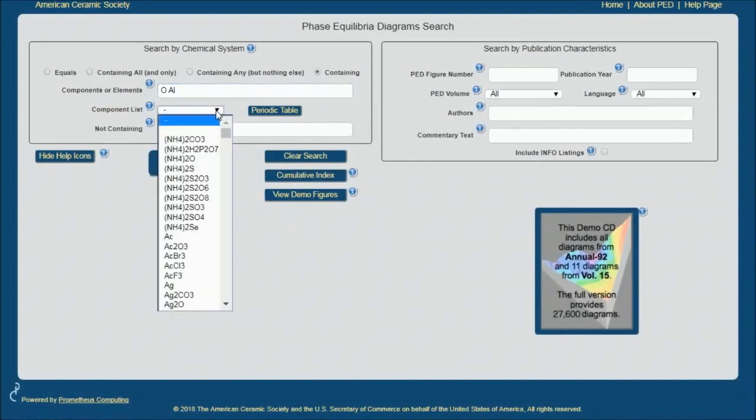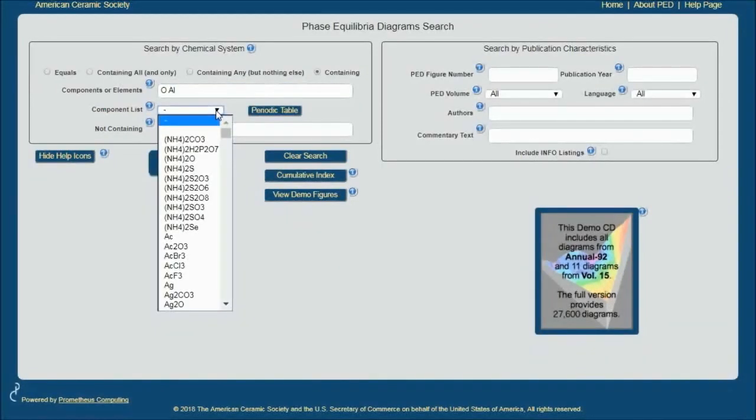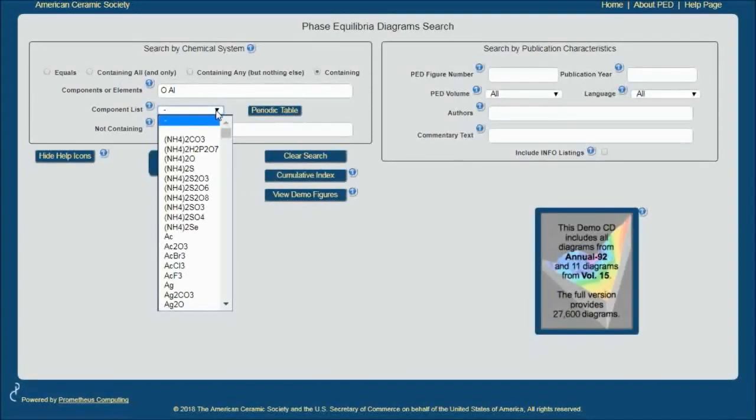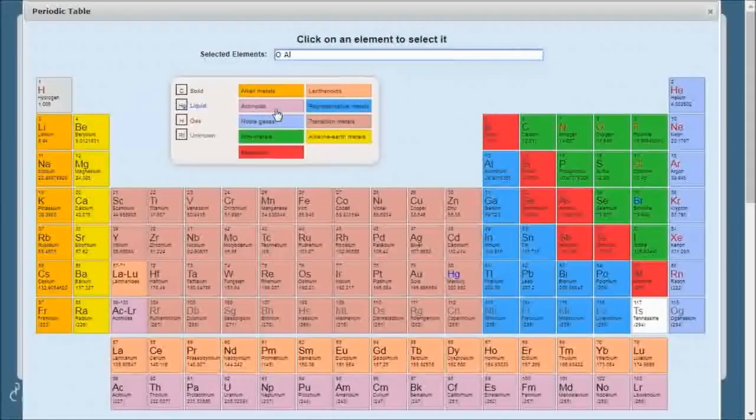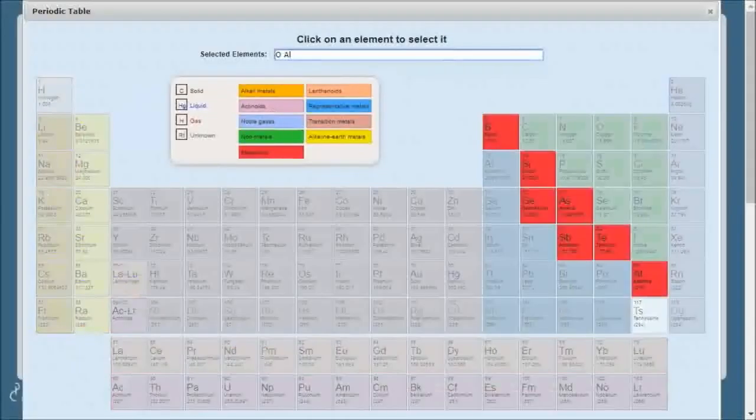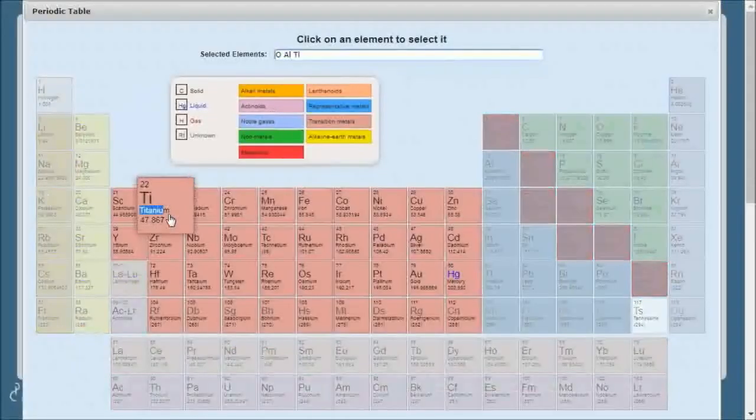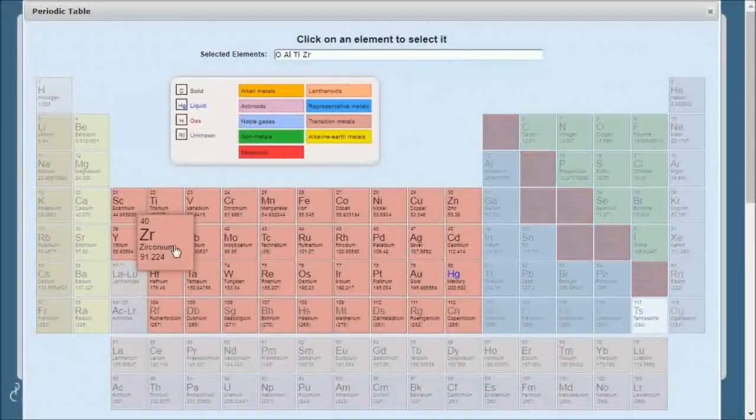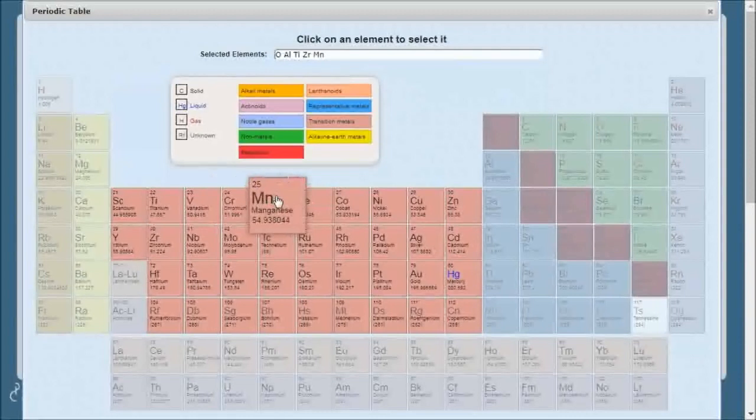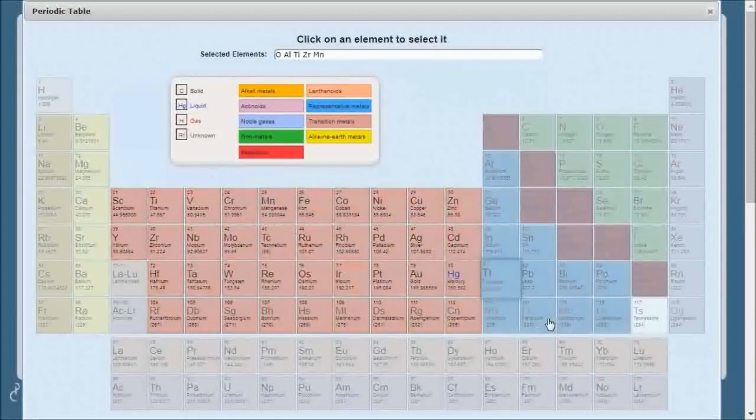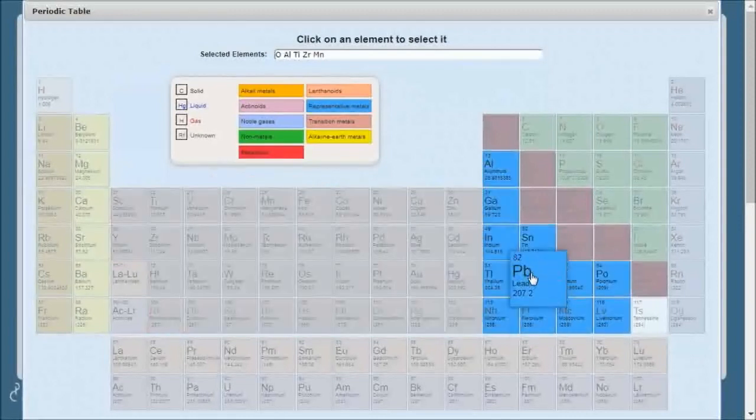You can also have a drop-down component list, which is particularly useful when you have compounds and you're not really sure how to enter them in. The third option is Periodic Table, and I'm using this to select some elements that make for some very interesting and useful ceramic systems.